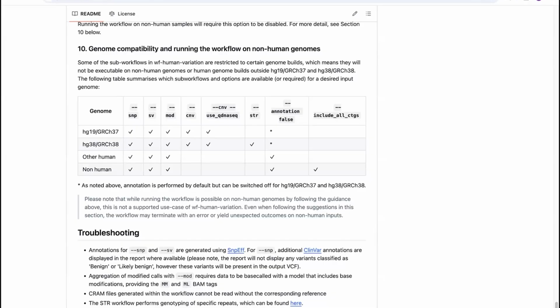With respect to the methylation analyses, specifically in our context, looking at the methylation profiles of cell-free DNA, I think one of our longer-term goals is to do some kind of methylation-based cell type or tissue origin classification. I was wondering if you know of anyone else doing that, or if you have any guiding points as far as where to get started on that. I know it's downstream of all the actual methylation calling and alignment and all that kind of stuff.